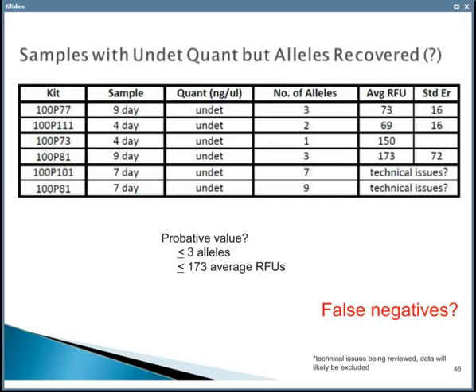So basically, with these undetectable samples, if you were to run them, you're not going to get profiles that I myself would ever report, the ones we've seen here.